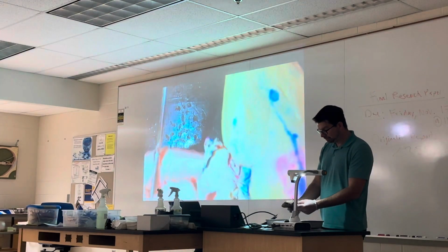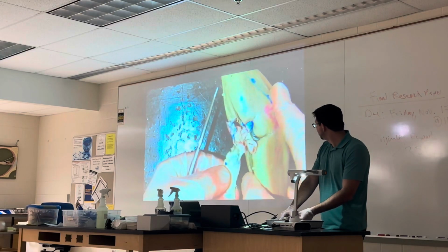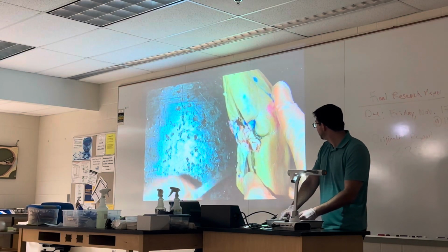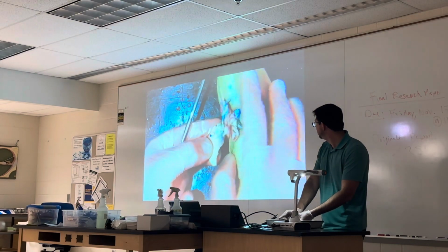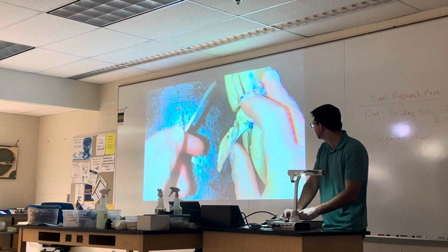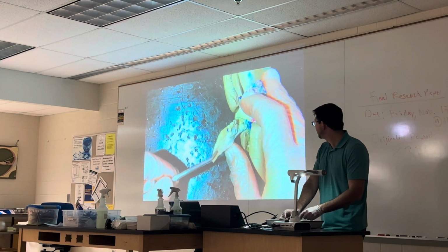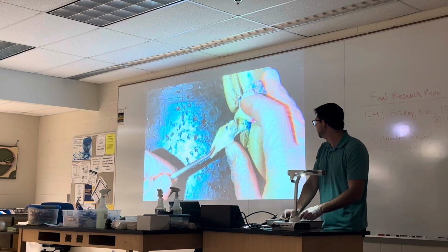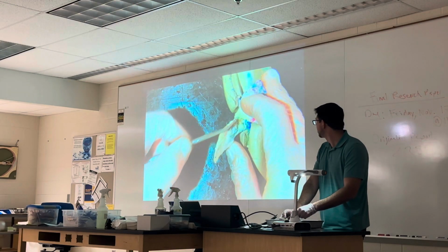And then the renal pelvis extends outside of the kidney. So what we're seeing here is the renal pelvis that protrudes outside of the kidney. So this is all renal pelvis right here, okay? And when you get to the bottom of the renal pelvis, right here, this is kind of the beginning of the ureter. So this is where the ureter would start right here. But up here would be the renal pelvis right there.